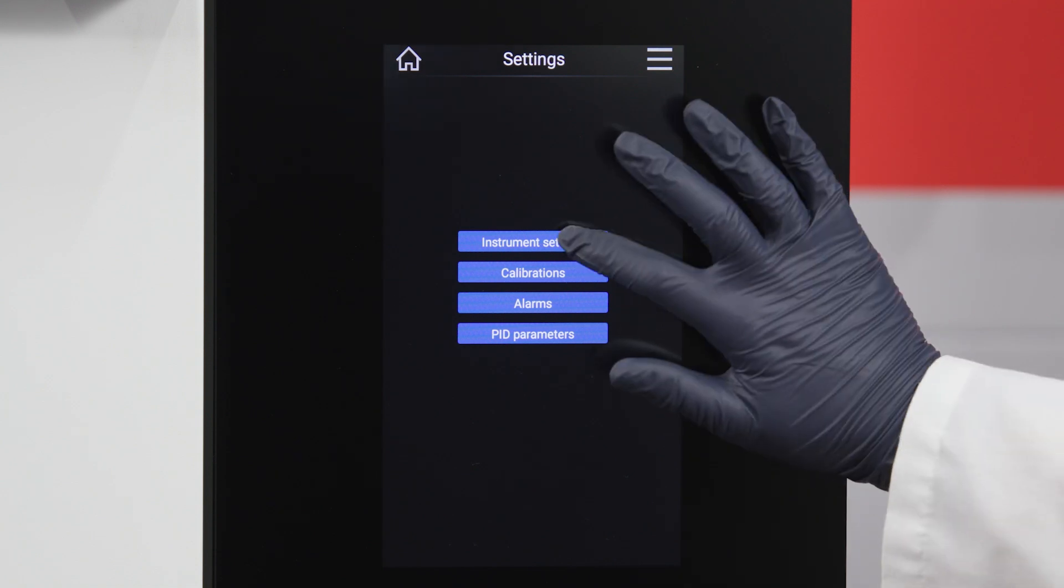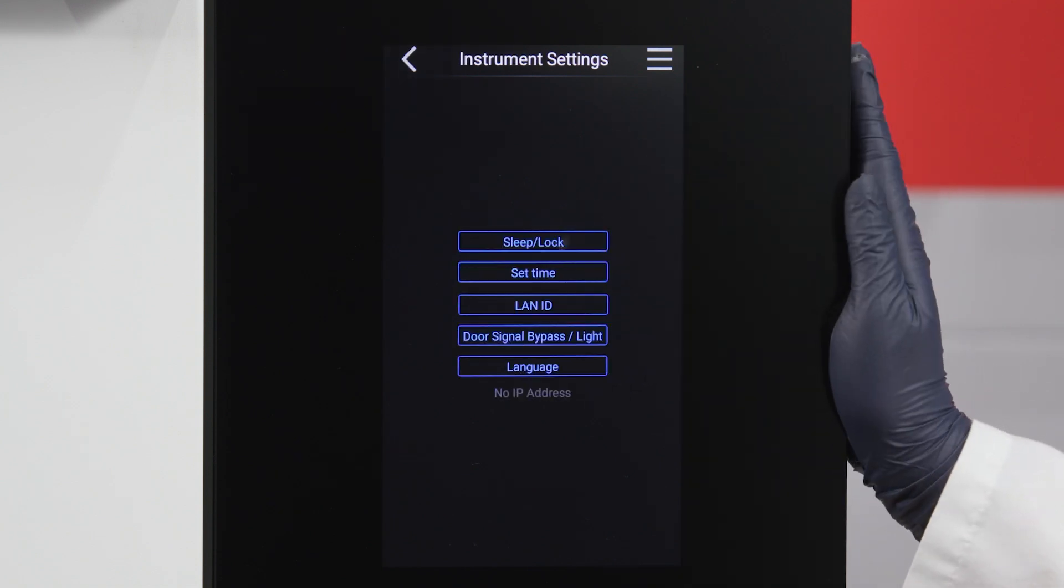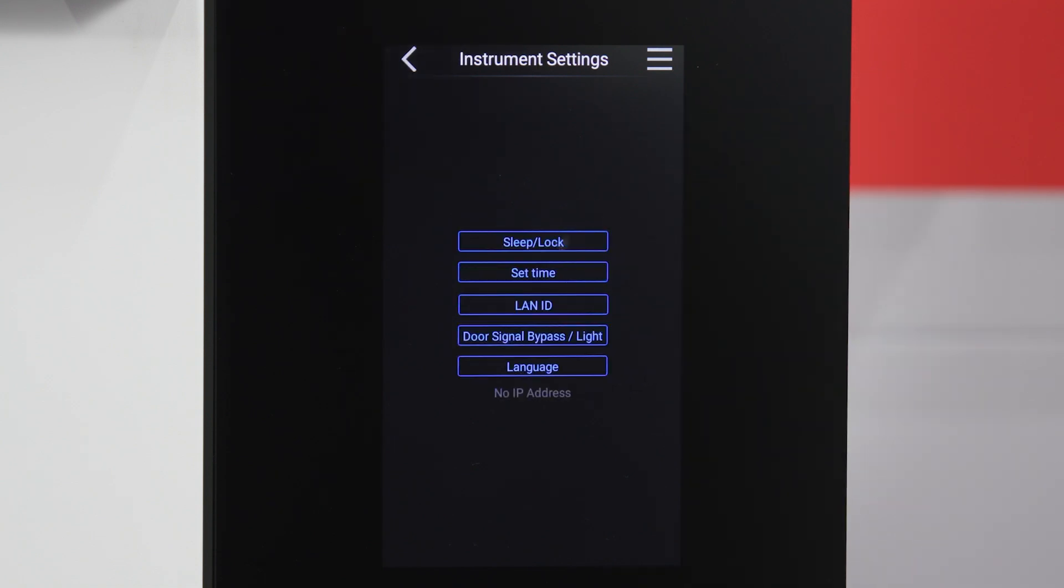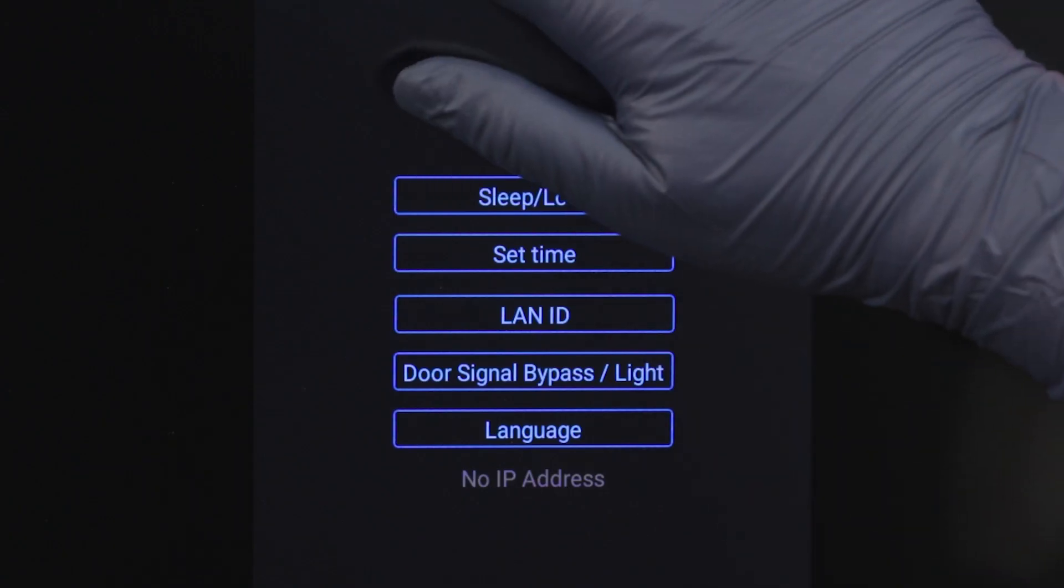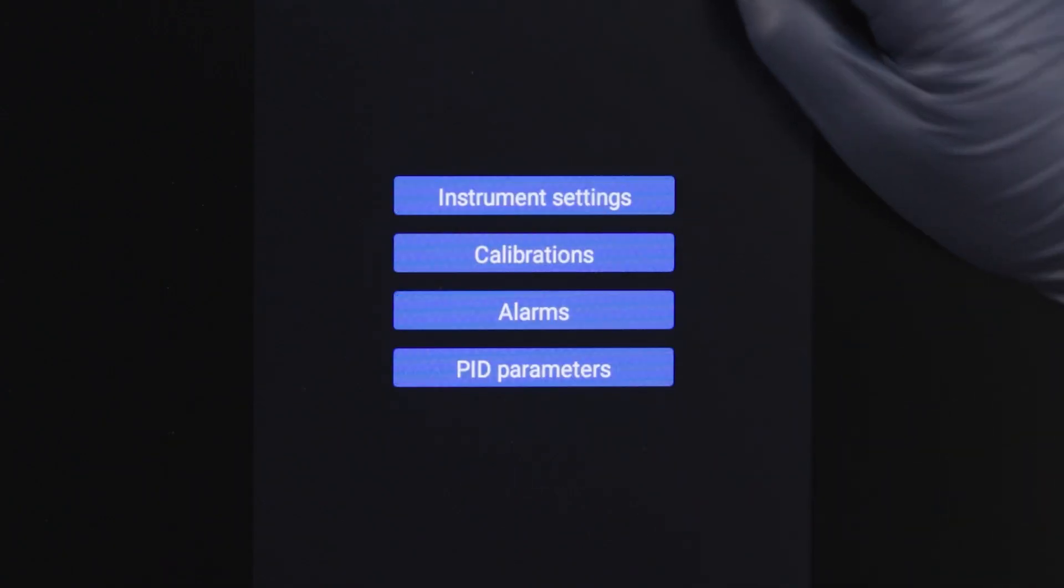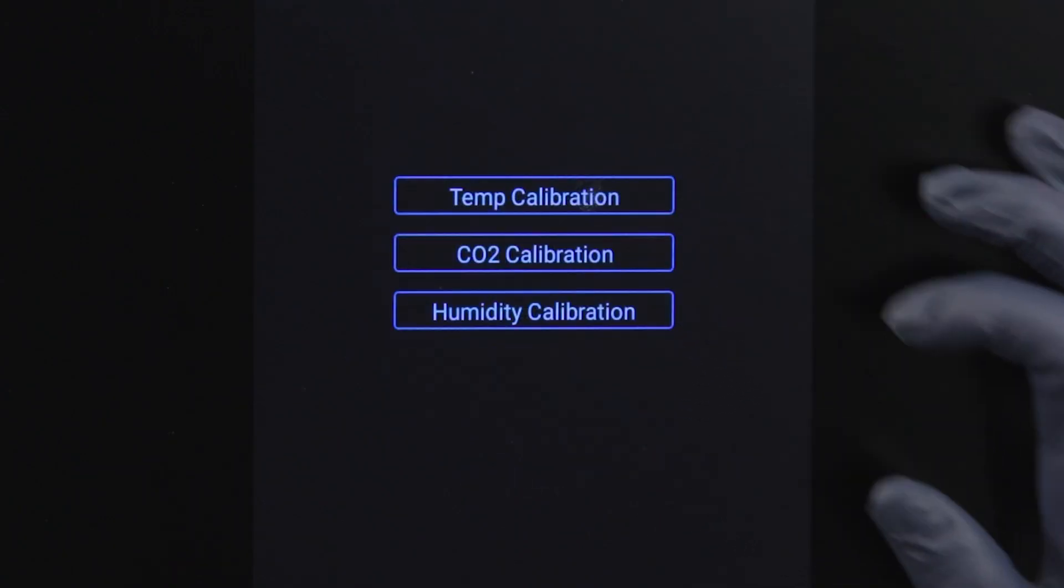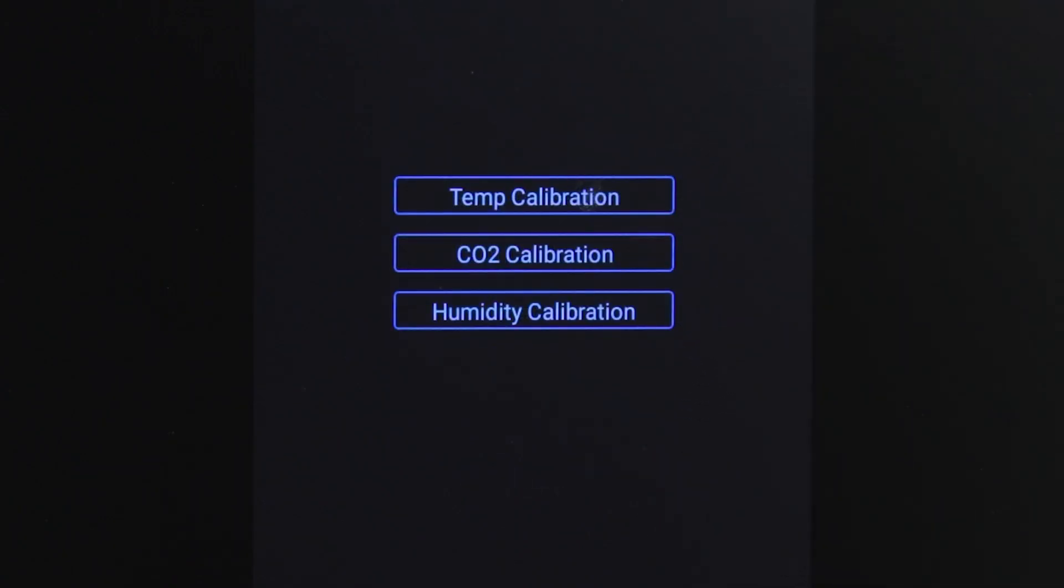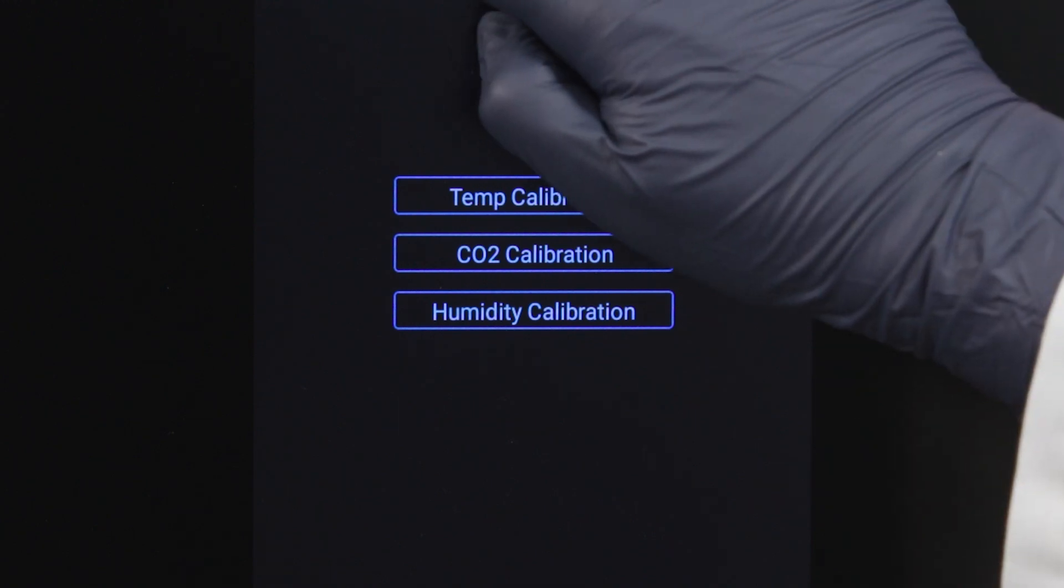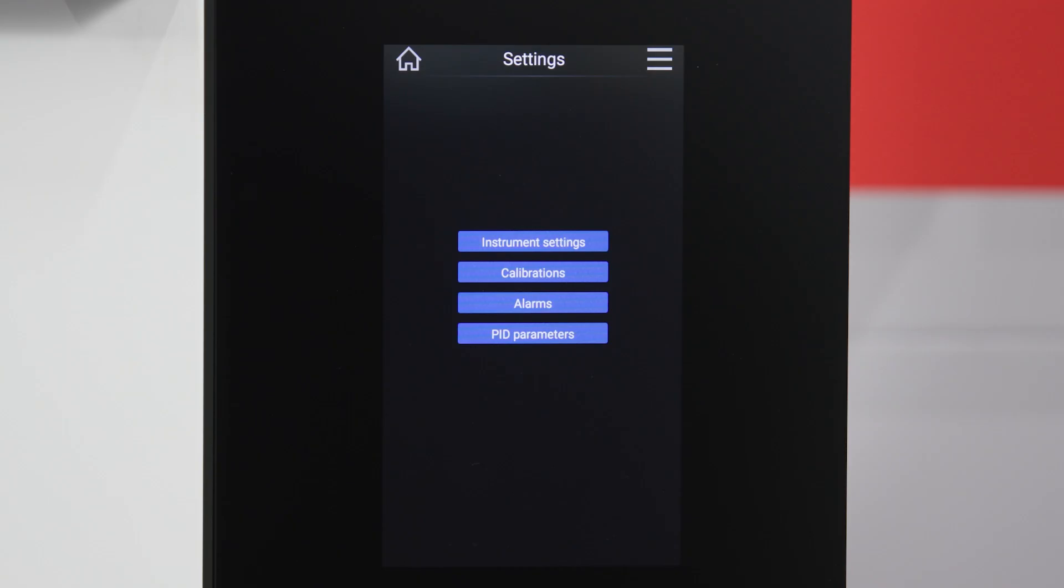Settings enables you to adjust instrument settings such as time, language, networking connections, and more. You can also adjust calibration settings from here, as well as alarms and PID parameters.